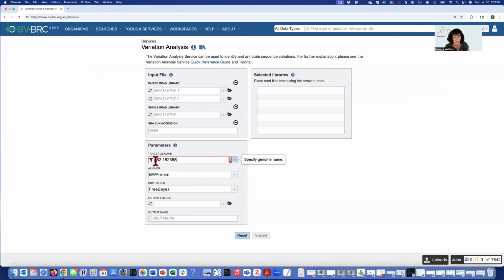And this is one of the genomes from that particular experiment, the ones that I went ahead and assembled and annotated, the isolates that were not exposed to antibiotics, because I wanted it to be as close to them as possible and watching them evolve in real time. So we have that. That's what I called it, not very original. Well, actually, it's very original. I always am talking about naming things so you know what they were. So I look at this and I know I trimmed the reads. It was sample 106 and I used Unicycler. So I always name things.